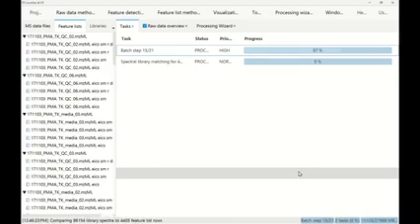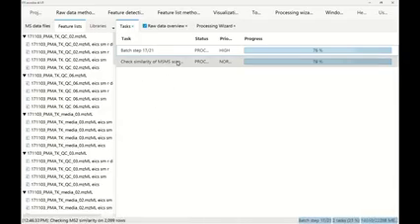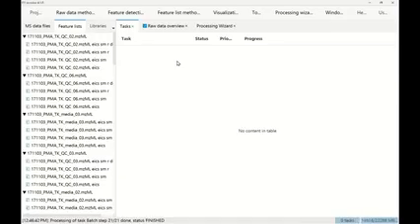So we're using modern Java 21, and it's then very easy for me to focus on just, okay, I want to generate the extracted ion chromatograms, let's say. And I can do this for each sample in parallel, and that's what you see happening here in the task manager. It's 21 steps that we're doing. It's already doing all the annotation, molecular networking, everything in MZmine, and I'm already done. So I hope that for you it was also kind of similar.